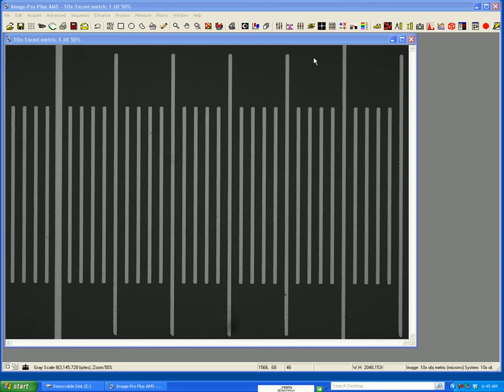Once you've acquired a calibration slide image, which I have showing on my desktop, these small divisions are 20 microns, this distance is 100 microns, and I've labeled what objective I acquired it with.